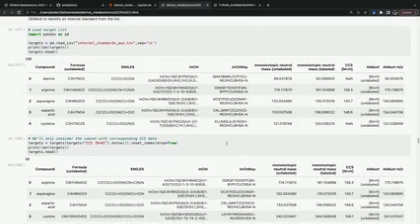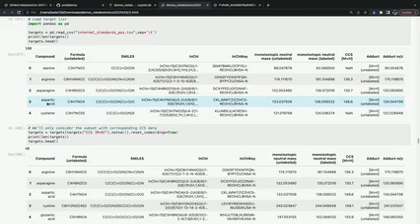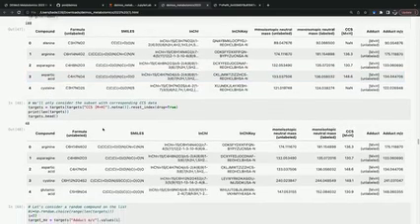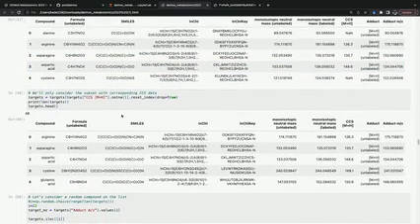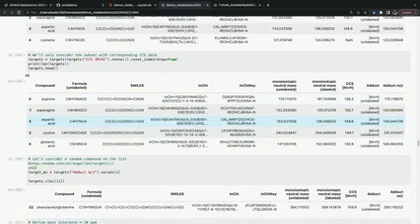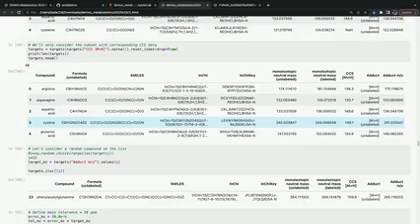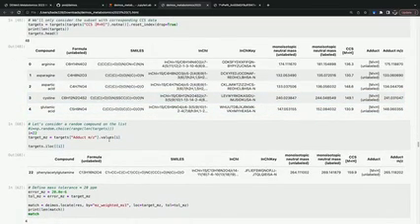Here, I'm just loading the target list using pandas, and then we'll only consider the subset of targets that have CCS data for the purposes of this demo. Just to demonstrate how to search for specific compounds, let's look at a random compound on the list.